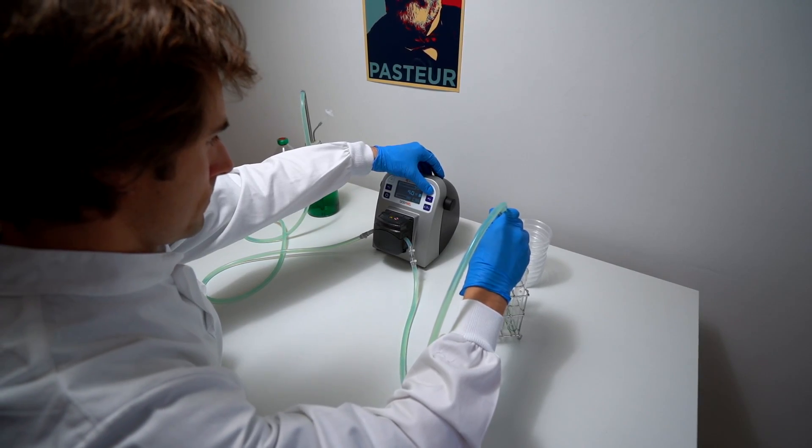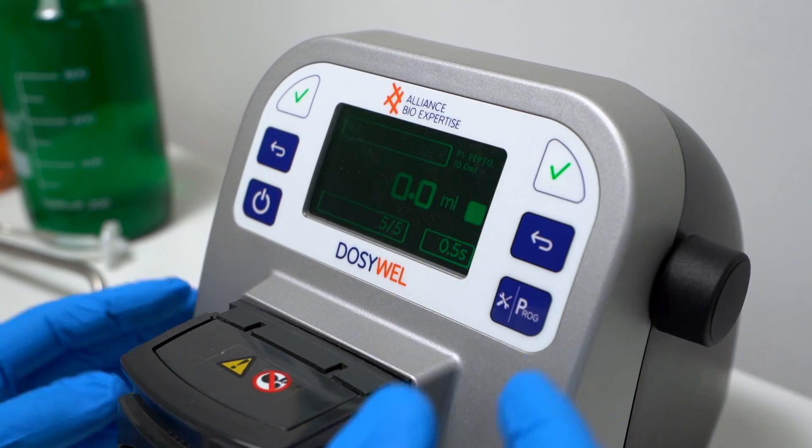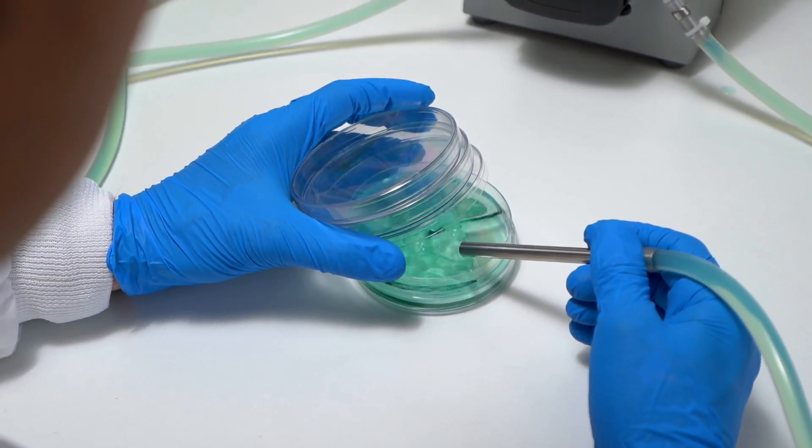When you are going really fast, you are losing precision. And the Dozy Well is really good for that because you can do calibration before, after, but also during the process. So you are sure that all your samples, your tubes, and your plates are having the same volume. So that's a really good point.